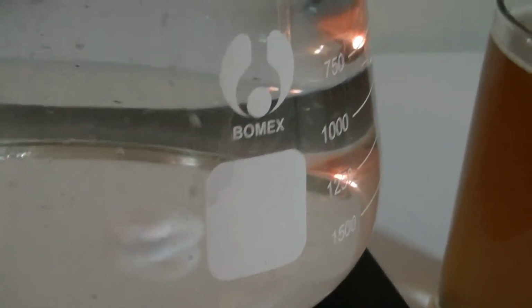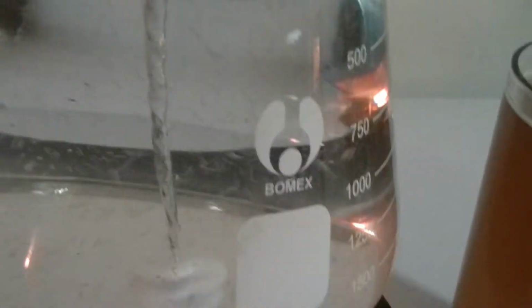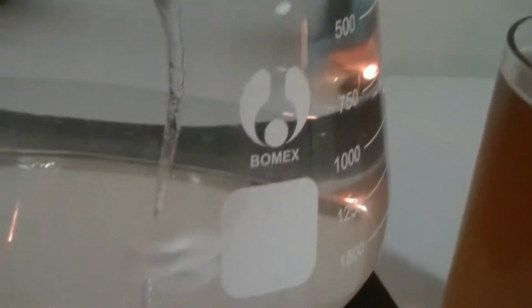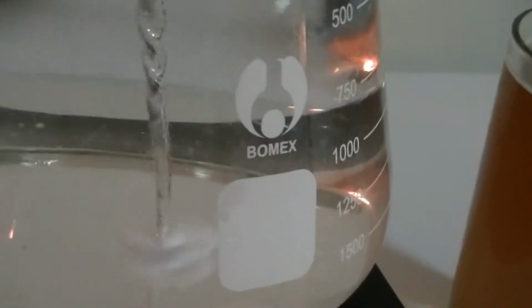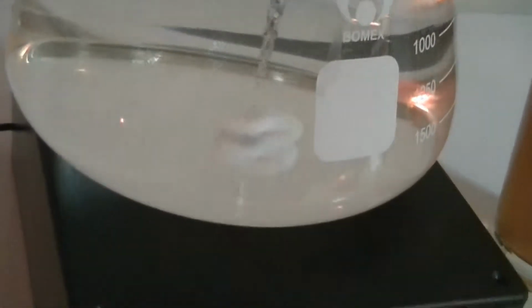Once we get it going here, you can see a nice tornado effect in there. That should stir up some yeast. Planning on doing some starters for some of my next brews that I got planned out. I thought that was a pretty cool little toy that I actually constructed myself.